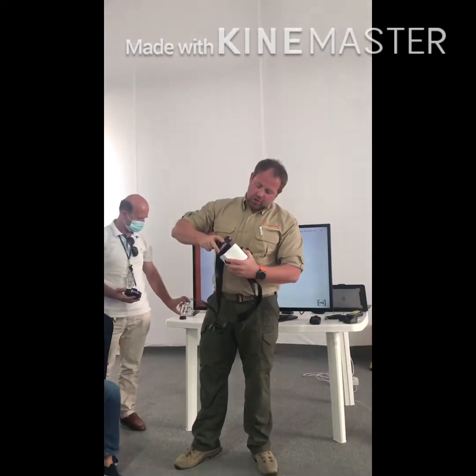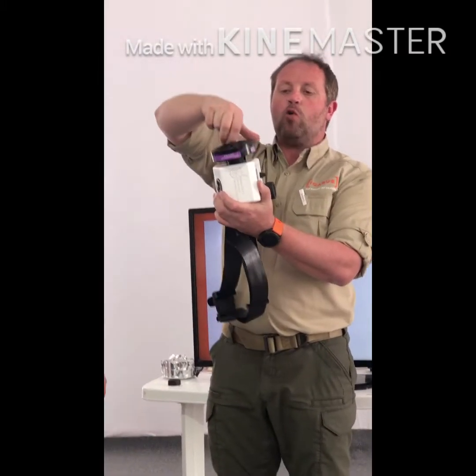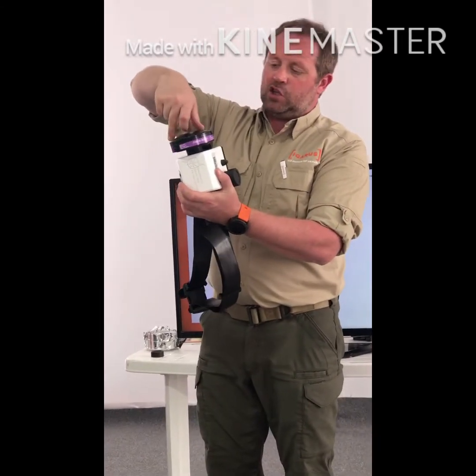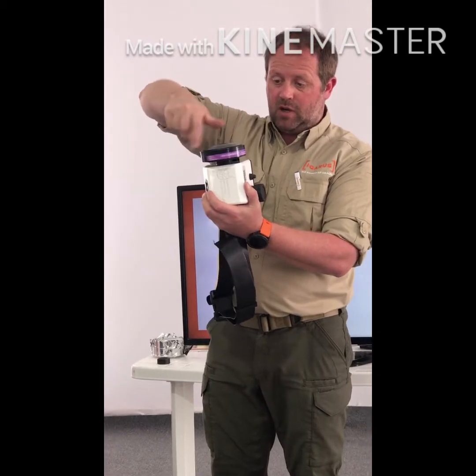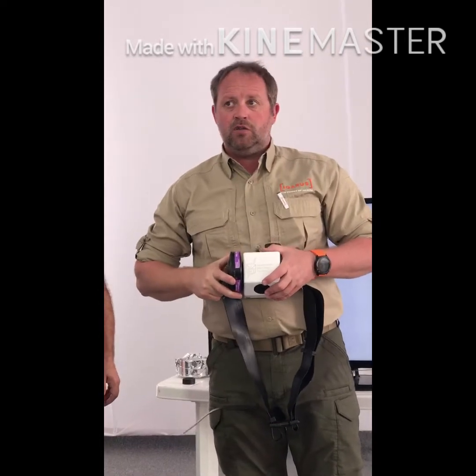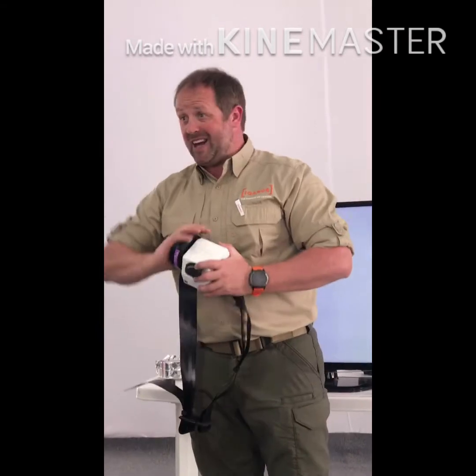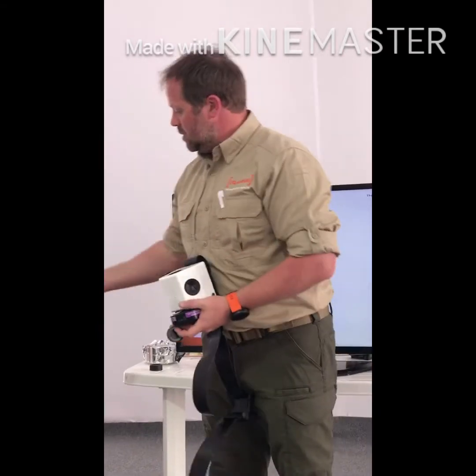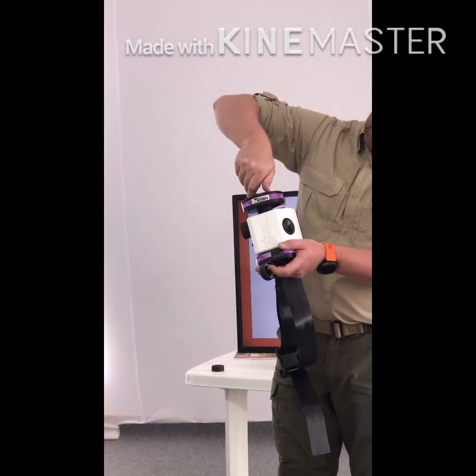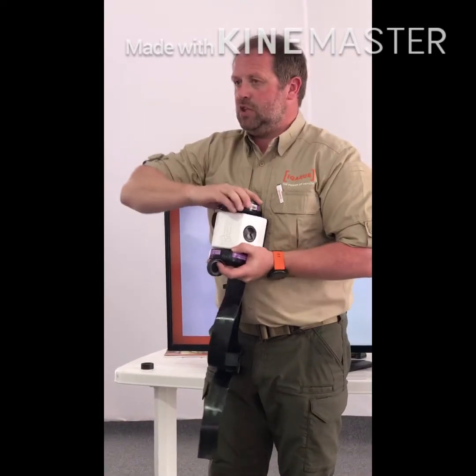Place your canisters on. What I do is I hold it uppermost, I turn it the wrong way first, because it allows it to drop in. Okay? It stops me cross-threading it. Right? And then just turn it. It only goes hand tight. Okay? There's no need to show me how much time you spend in the gym. Because if you do that, you'll just break the canister. So again, place it on top, turn it the wrong way, and you'll see that it just drops into place. And then turn on to that point.